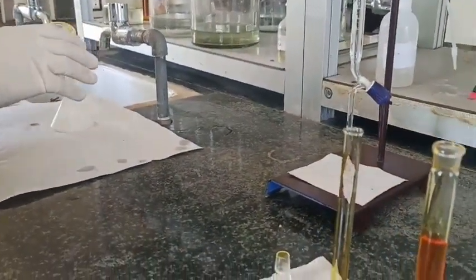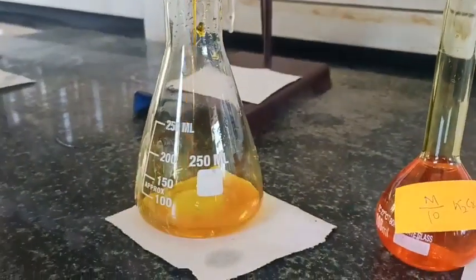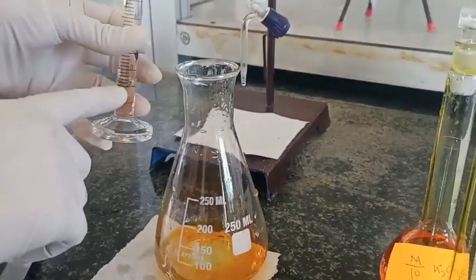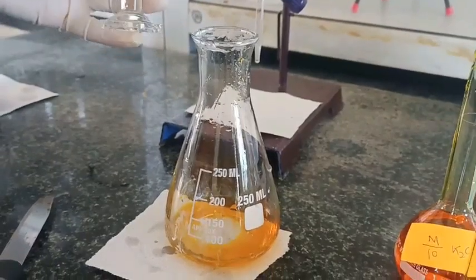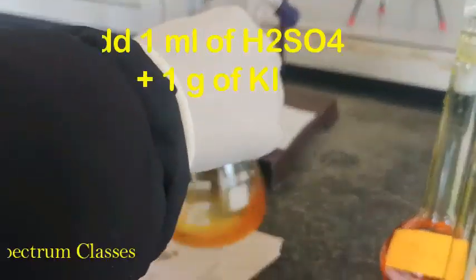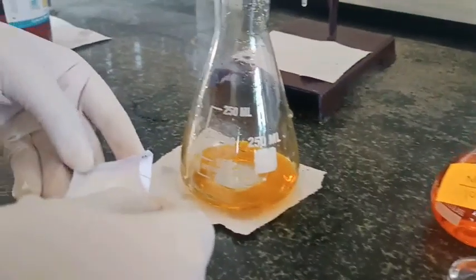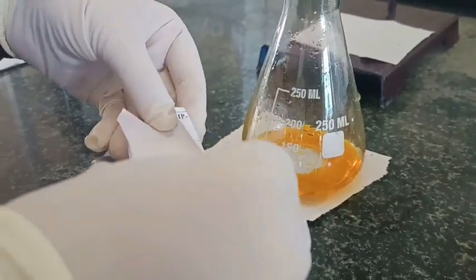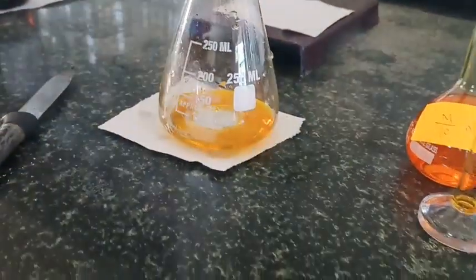So for that purpose I am just going to rinse my conical flask, and taking 10 ml of this. Now to this K2Cr2O7 I am just going to add some acid, H2SO4, and to this I am just going to add potassium iodide, and here you see the change in color.